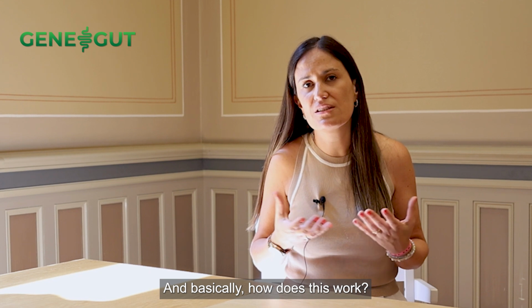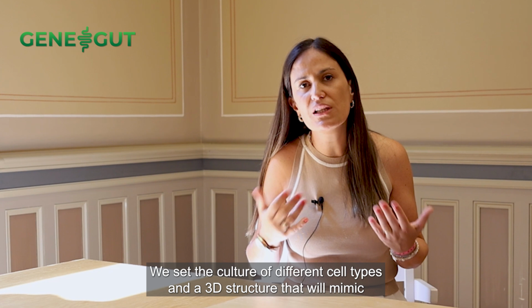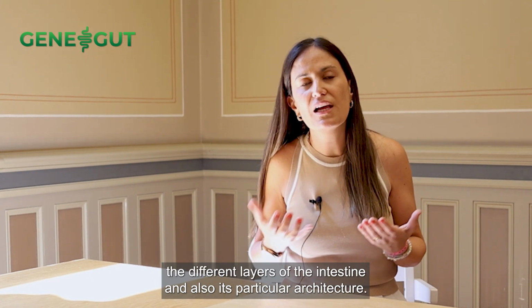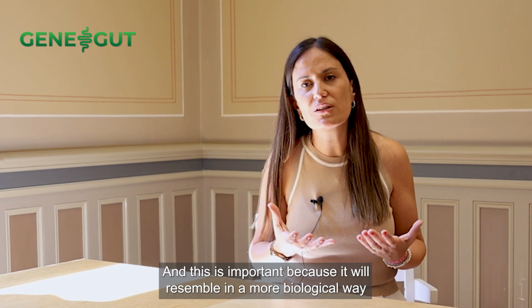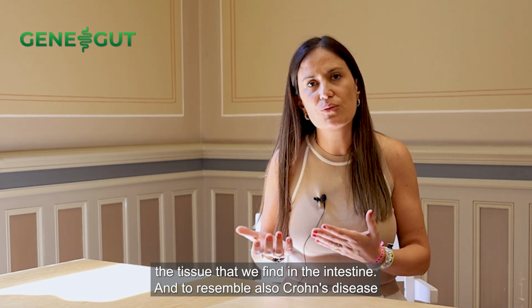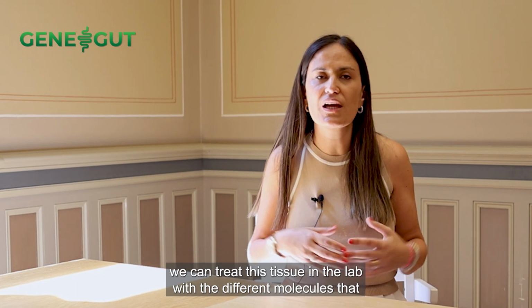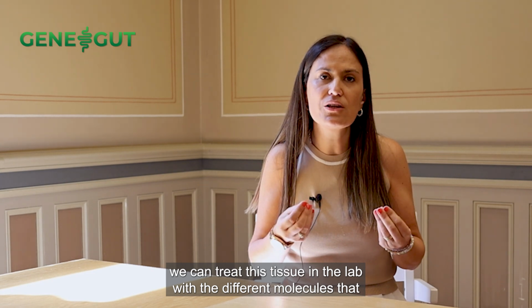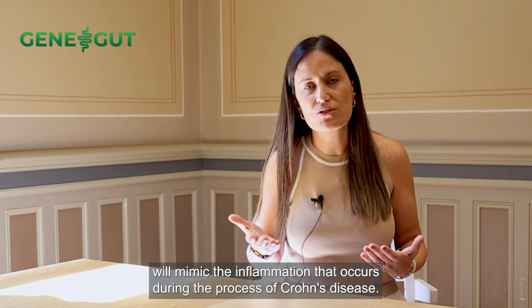And basically, how does this work? We set the culture of different cell types and a 3D structure that will mimic the different layers of the intestine and also its particular architecture. This is important because it will resemble in a more biological way the tissue that we find in the intestine. And to resemble also Crohn's disease, we can treat this tissue in the lab with different molecules that will mimic the inflammation that occurs during the process of Crohn's disease.